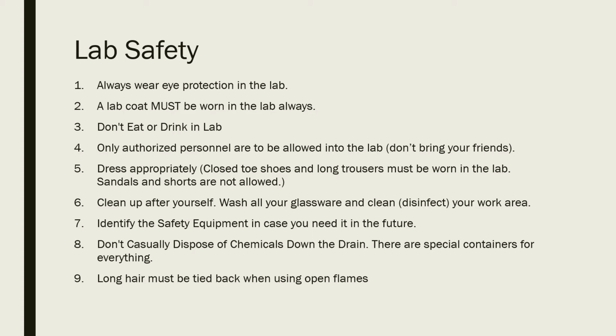Make sure that only authorized personnel are in the lab. We don't want accidents to happen because someone doesn't belong in the lab. Always dress appropriately. Again, you want to protect yourself so that chemicals don't get on your skin. Make sure to always clean up after yourself, so washing your glassware, washing your bench, disinfecting your work area, things like that.